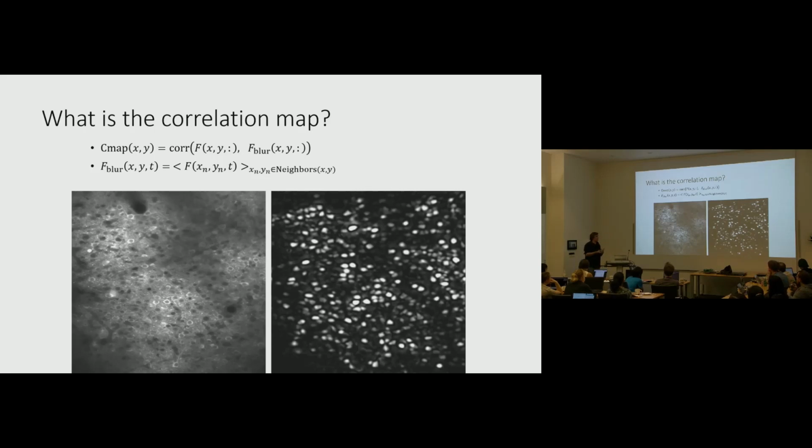And so for that, we actually need more of an iterative process, where we start from here maybe and start picking out ROIs one by one, and we keep peeling off that ROI's activity. We keep subtracting it off from the raw movie so that it no longer contributes to the correlations between pixels. Now the dimmer thing that was another cell will be the only thing in that area, so we can find it again in this correlation map just with our peak finding algorithm. So that's the basic logic of the algorithm.